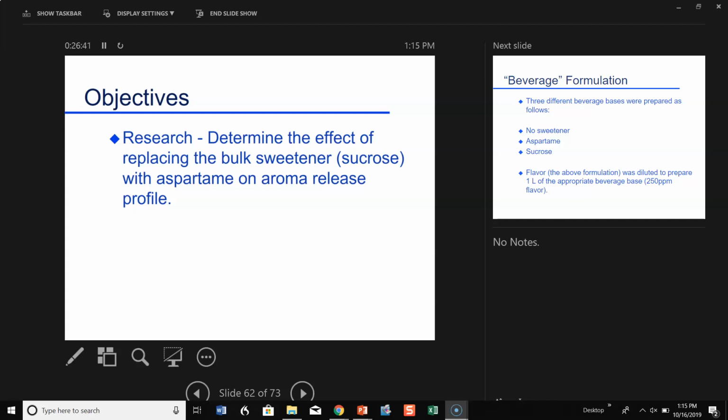So it's really a fascinating tool, and we would never have had this knowledge if we didn't have mass spectrometry that could manage large molecules. So again, the only way we found this is having mass spectrometry.